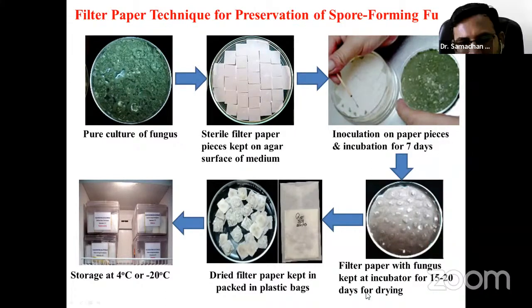Then after incubating the filter paper with fungus, keep it for 15 to 20 days for drying in the incubator. Then after drying, the dried filter paper is packed in plastic bags. After packing in the plastic bag, store at 4 degrees Celsius or minus 20 degrees Celsius.